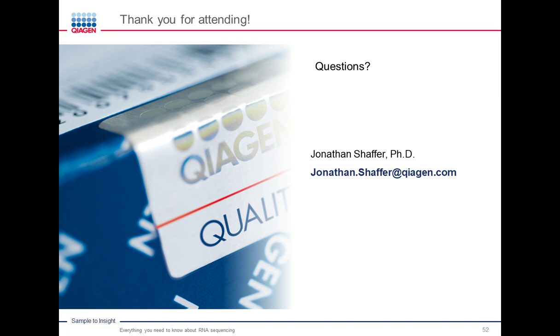And how much starting material do you recommend? Typically speaking, we start with 200 microliters of serum or plasma. Comfortably, you can go down to 100 microliters. Mildly uncomfortably, you can go down to even 25 microliters. But all things being equal, I would start with 200 microliters. And if you're working with exosomes, I would probably start with 1 milliliter, just because the amount of RNA should be even much lower because you're looking at a subcompartment.